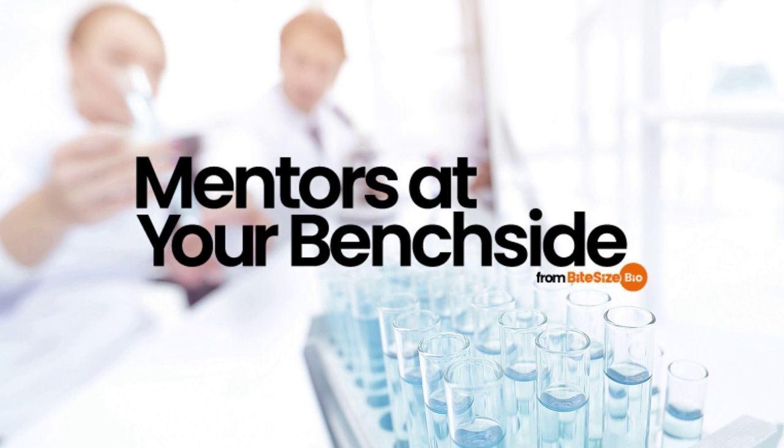Even if you're doing something more qualitative, getting a good idea of how much protein you have will enable you to compare results from one experiment to the next and from one protein to the next. There are lots of ways to measure protein concentration, and each of them has its own advantages and disadvantages. It can be difficult to decide on the best method for your protein, especially considering that even the most humble protein quantification assay uses some pretty sophisticated chemistry that can trip you up, particularly if you're working with detergents. Let's briefly go into 5 useful assays.